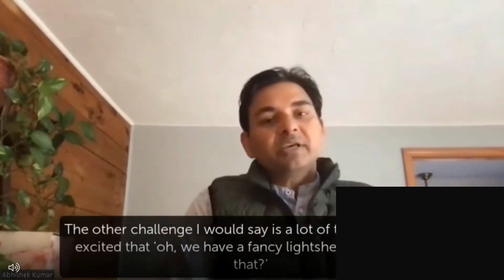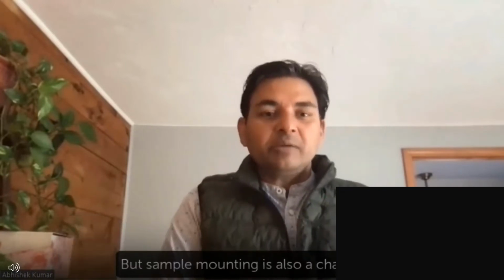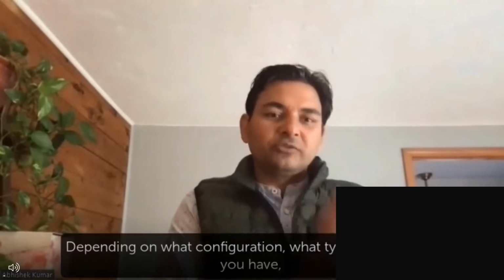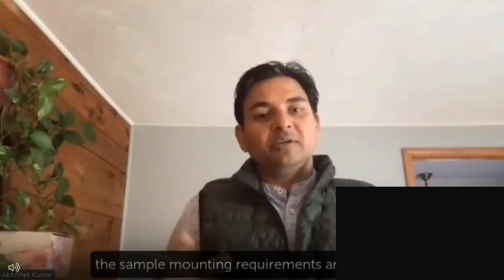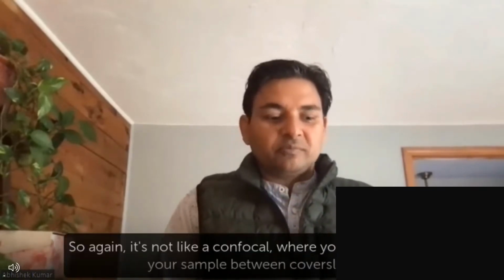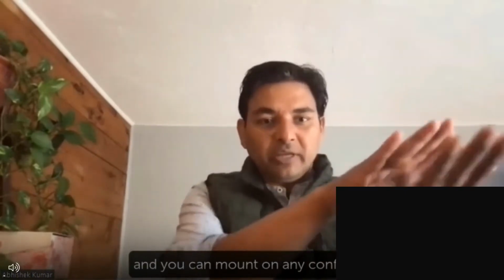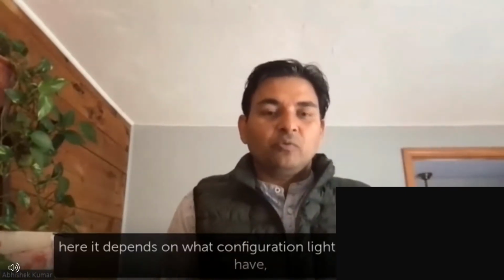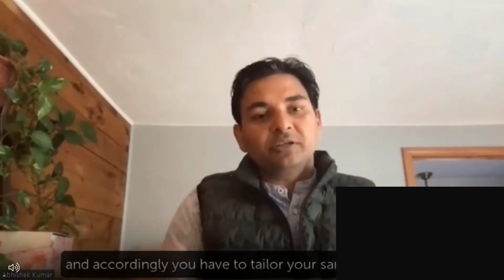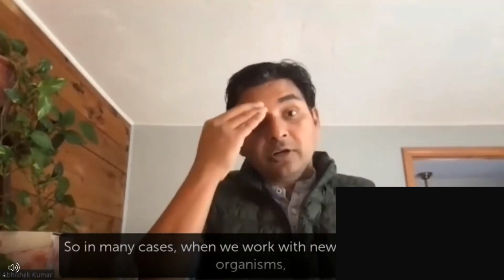The other challenge, I would say, is a lot of times people get excited that, oh, we have a fancy light sheet, can I image that? But sample mounting is also a challenge. Depending on what configuration, what type of light sheet you have, the sample mounting requirements are different. It's not like a confocal where you somehow put your sample between cover slips and you can mount on any confocal. Here it depends what configuration light sheet system you have, and accordingly you have to tailor your sample mounting.